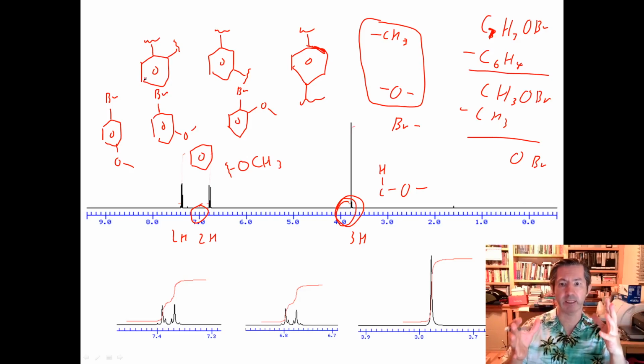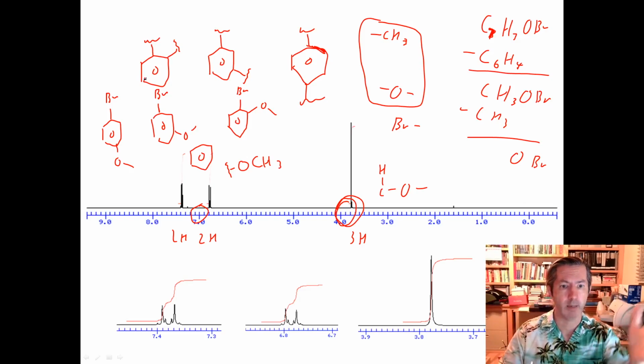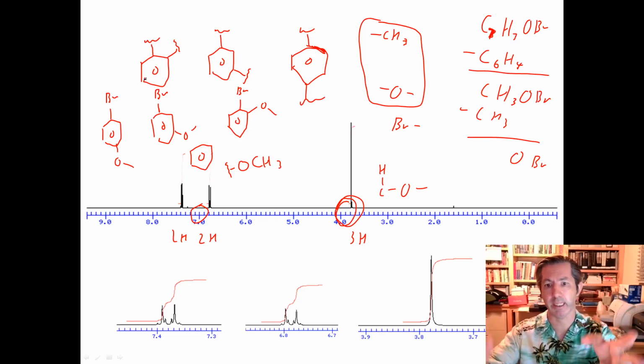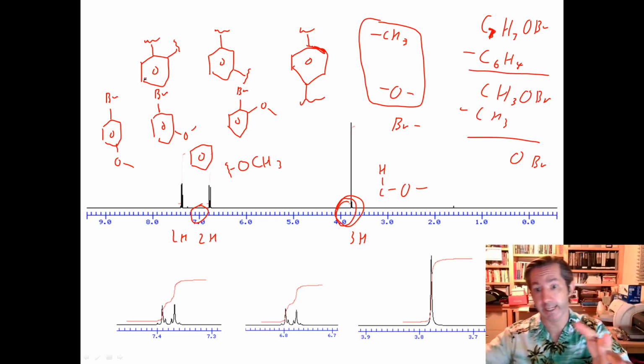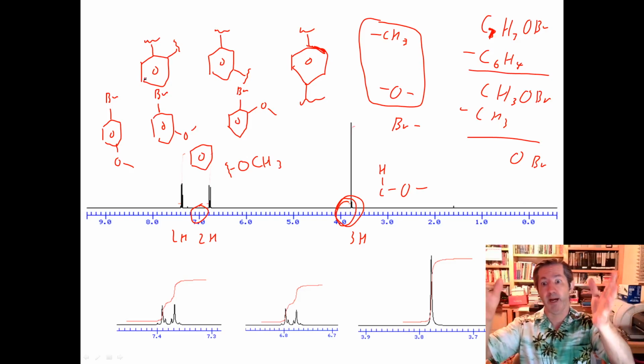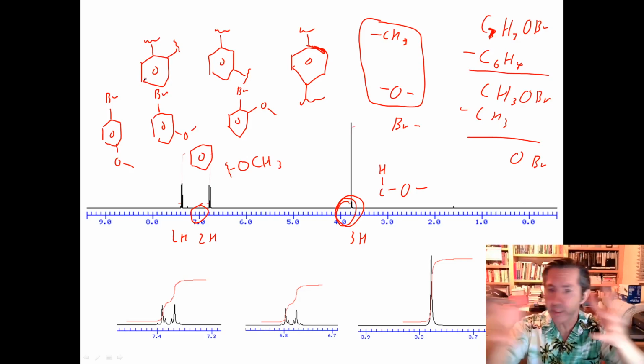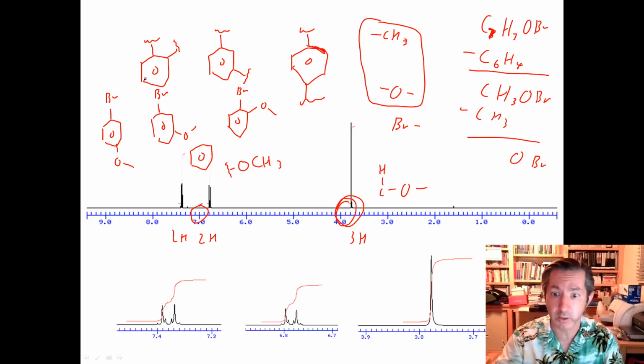And you may have seen a standardized test like there's 5 desks in a room. Bob likes to sit next to Jane. Jane likes to sit on an end desk. Jim likes to sit next to Mary. Bob can't sit next to Mary because of the restraining order. And you gradually use all these parameters to put people in their seats. You're doing the same thing here using this splitting.